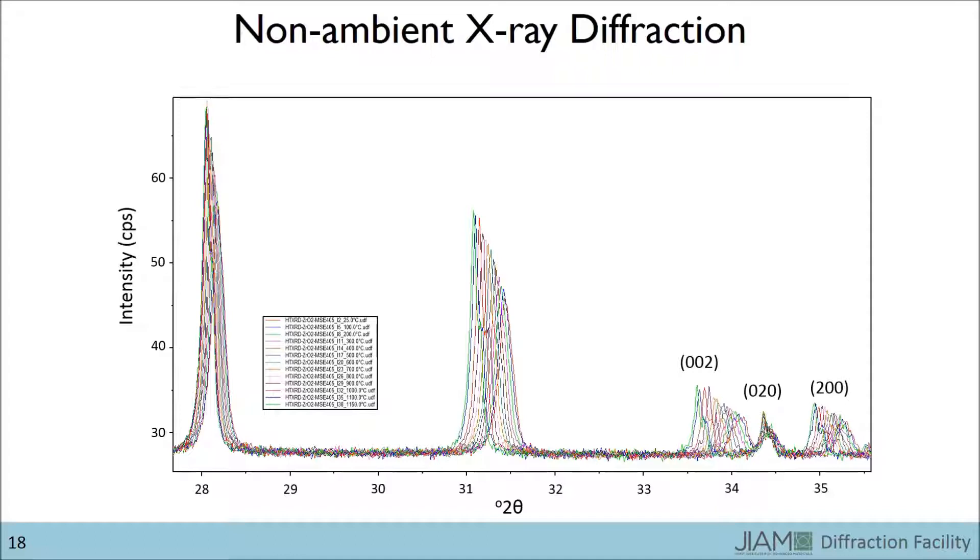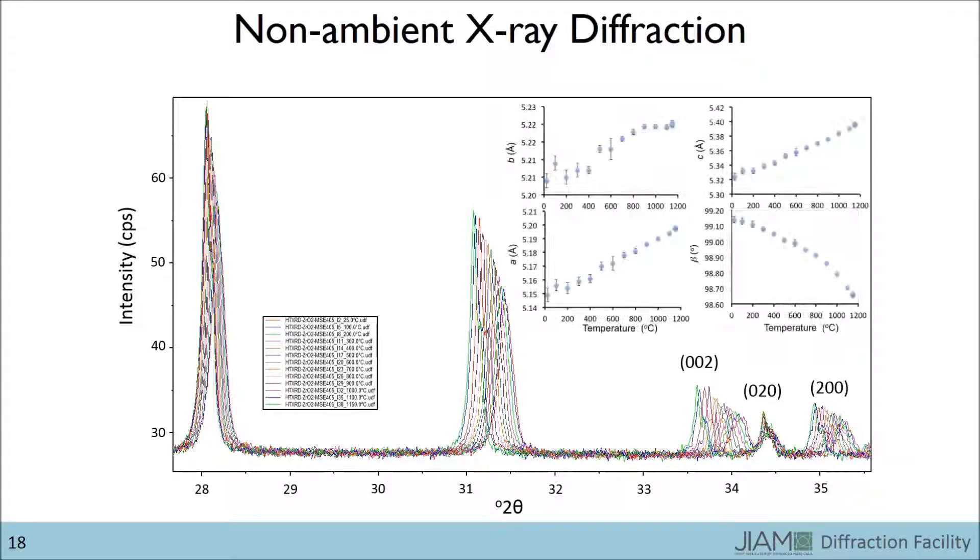We can see that the peaks for the 002 and 200 planes shift to lower angles with increasing temperature, while the 020 peak remains relatively unchanged. In a single series of experiments, values for each lattice parameter can be determined for each temperature.